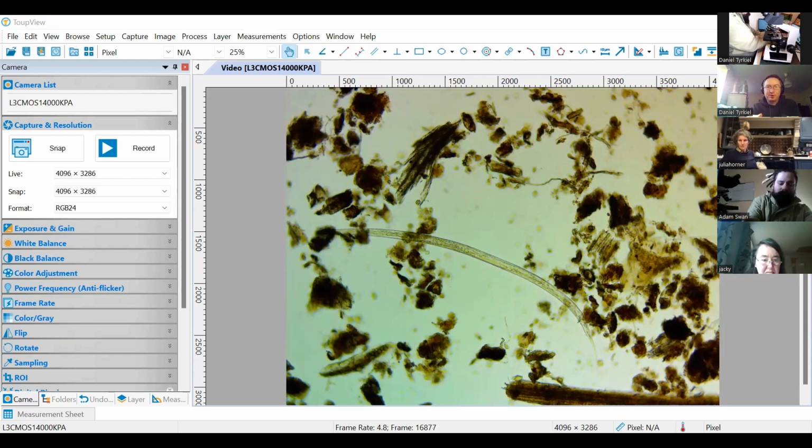But if you're looking for a quick assessment, again, just use direct microscopy using this method. If you have to be more accurate, you just need to do more drops and pull an average out of those.